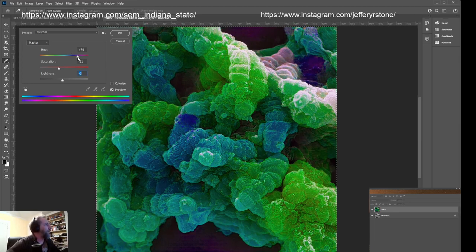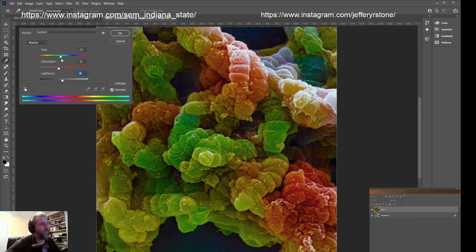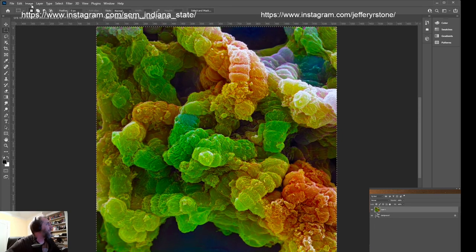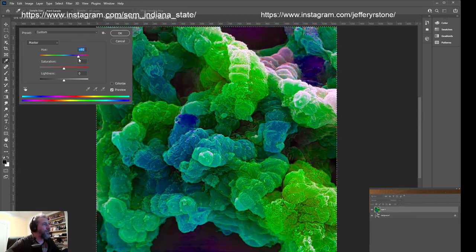I'm just sliding the hue slider, right? So the way that usually works is sliding around these sliders until you're happy with it. And so again, this is where you have to make decisions, right? The original image was this color, and I just went under adjustments for images and to hue, and then you can make decisions. I'm happier with it being a blue color because I want it to be blue green like algae actually is.